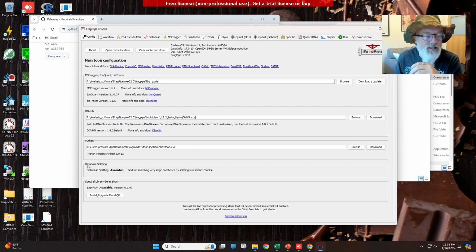Python, you could download Python. And if you want to generate spectral libraries, you can click on install, upgrade, EasyPQP, which I think we'll need, but it already says it's available. So if it's not available, I think you'll have to download that.